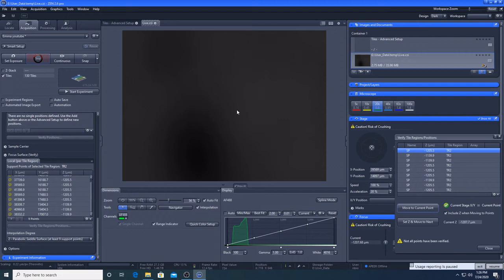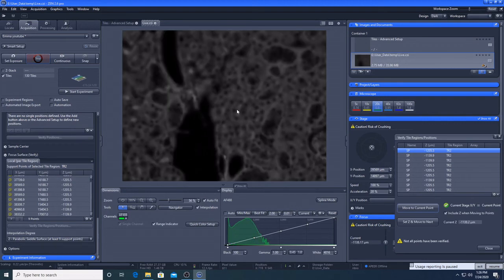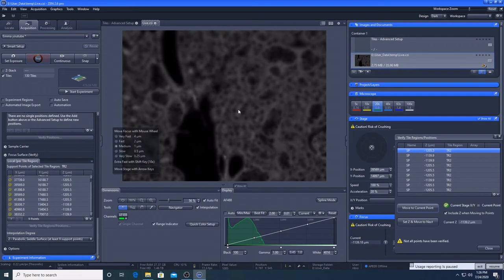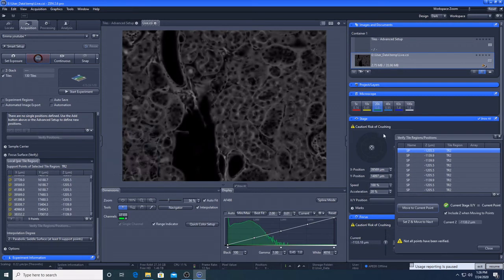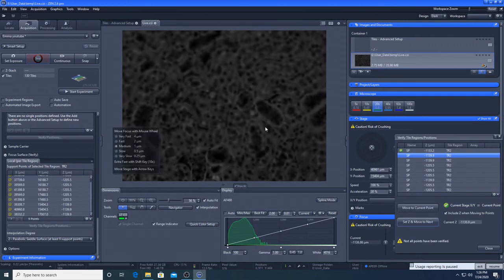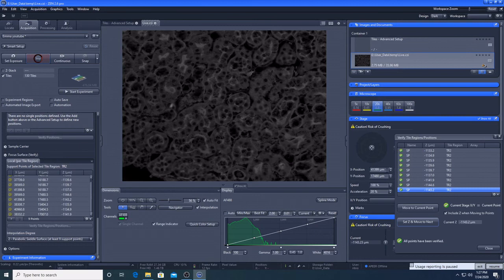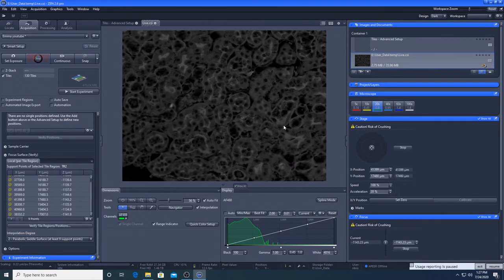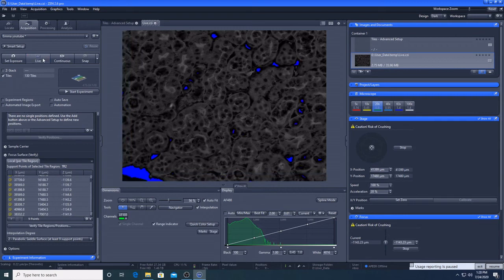So we're going to focus each of these. So I'm going to set Z and move to next. Just do this for all nine. So that's all of them. So I'm going to close. So they are all, all our support points are ready to go. So press stop.